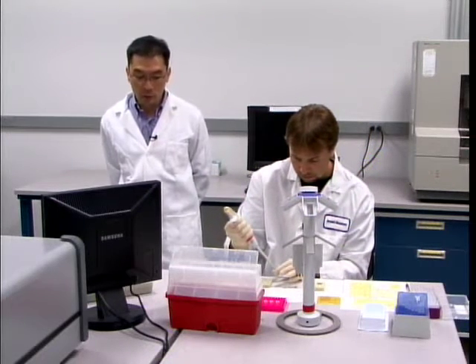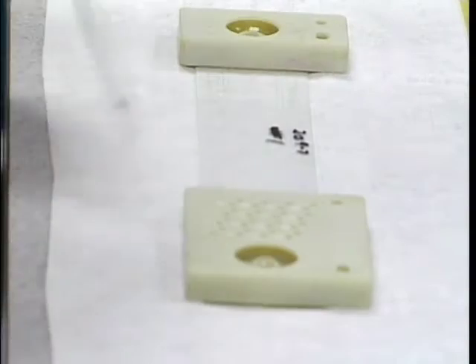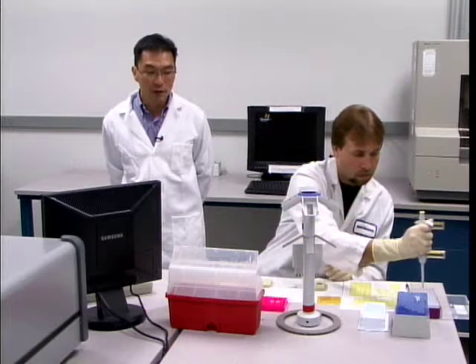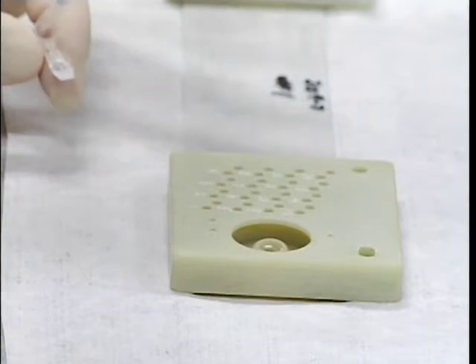The samples are prepared by mixing 2.7 microliters of PCR product with a master mix consisting of sizing standard and formamide. The total volume loaded into each of the sample wells is 13 microliters.